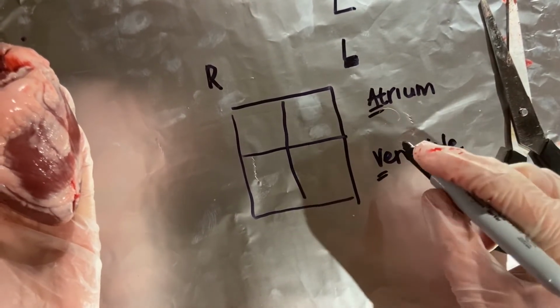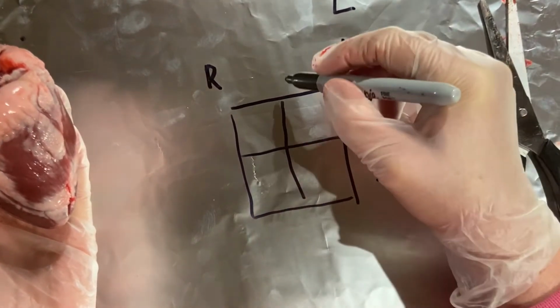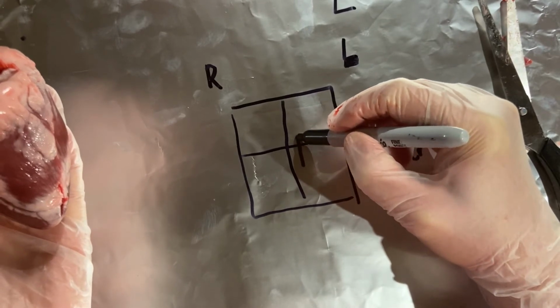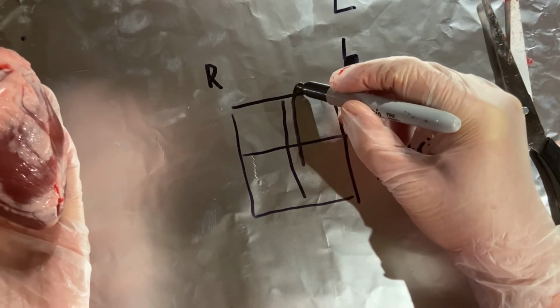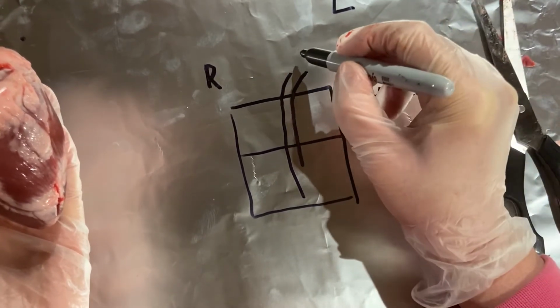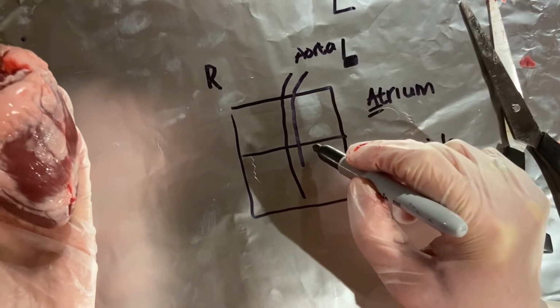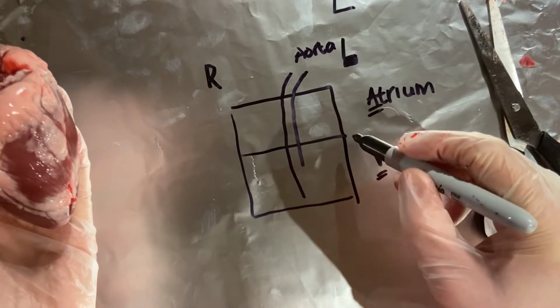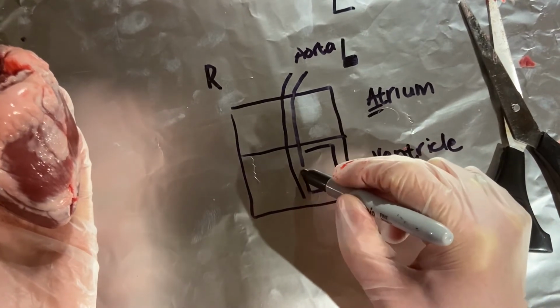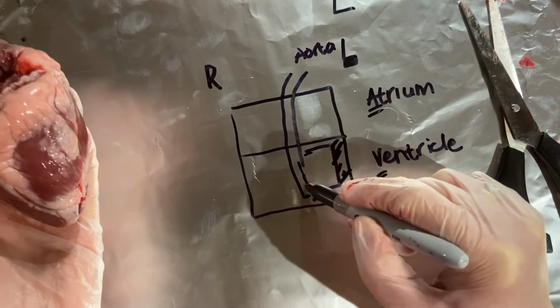Okay, now because the left ventricle gets to eventually pump blood, when that contracts, it's going to pump blood to the rest of the body via the aorta. Because it's got to pump blood all around the body, these walls tend to be by far the thickest walls. So this is going to be a very, very thick wall.